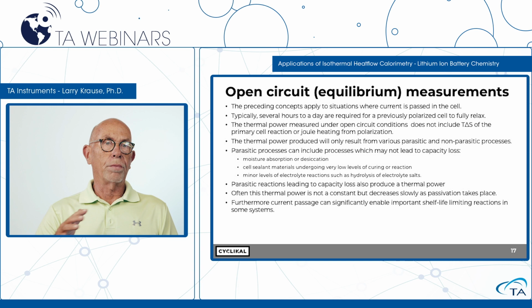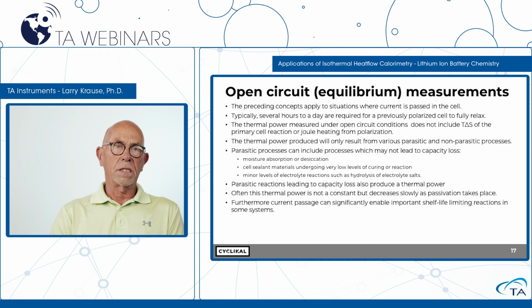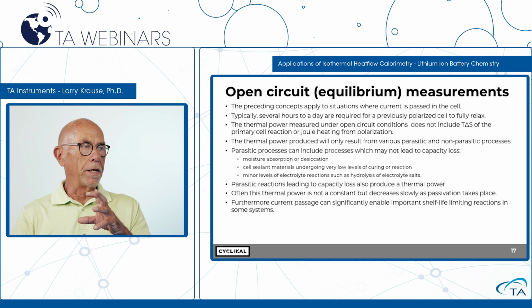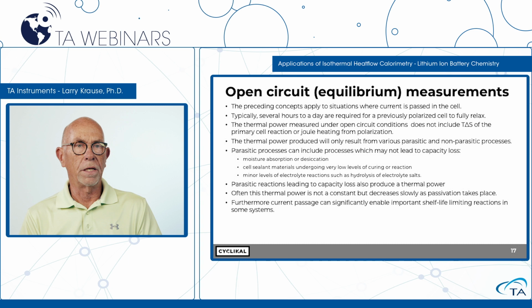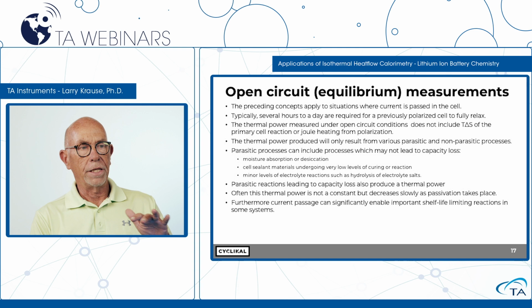For example, a lot of batteries have passivation layers that form on them, like a metallic lithium surface. Allow a metallic lithium surface in a battery to sit for a while, and it forms a passive layer on the top of it. It becomes quiet. And if you look at the calorimetric response, it just exponentially decays. Now start that battery up again, and you start plating or stripping lithium off of it. That passive layer is disrupted, and now you have fresh lithium surfaces which the electrolyte can react with again. And so you have this parasitic reaction that now is brought to the surface again, and you'll measure a much higher degradation of the thermal power after you go open circuit. So a lot of it depends on the application you're using it for.